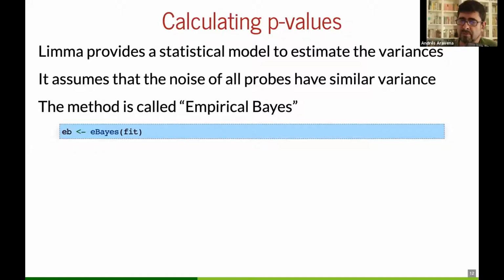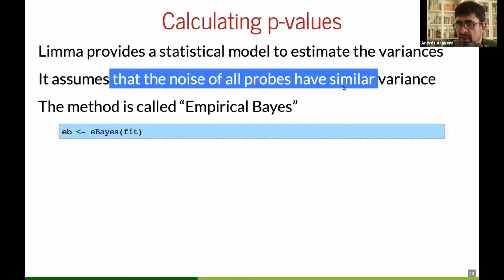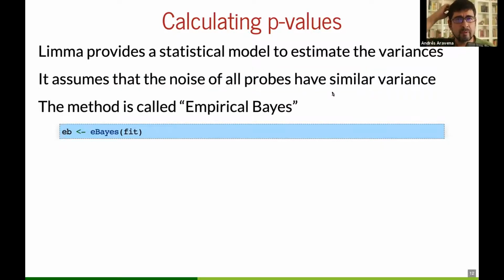That is what you want to measure. So here they have an assumption. I really don't know the details, but according to the paper, they essentially say, look, we have all these probes in the same array, and they are made together. So they are making the assumption that they have not necessarily the same variance. The noise that affects them is not necessarily identical, but it's similar. So they are using all the data in order to estimate the variance.